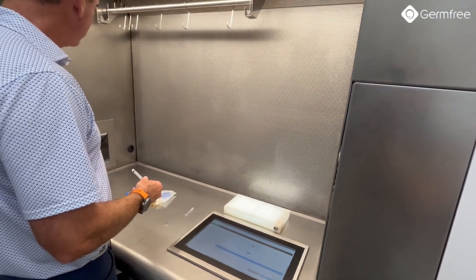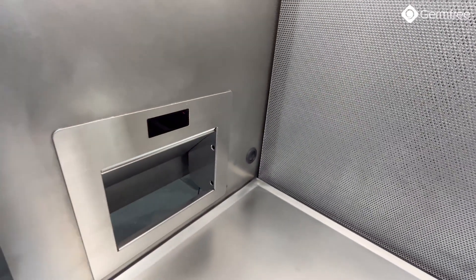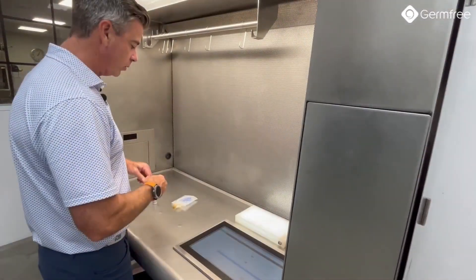Now I'm going to actually compound my preparation, and all the while I can use my wave-activated trash sensor to actually remove waste.